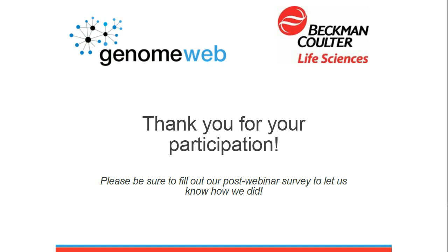It's probably when we close the plate after it is returned by the Echo, we have to put a lid on, or originally in the destination plate there was some dust or things like this. So there are not more outliers than when you do the reactions by hand. The Echo does not introduce any major issues at that level.